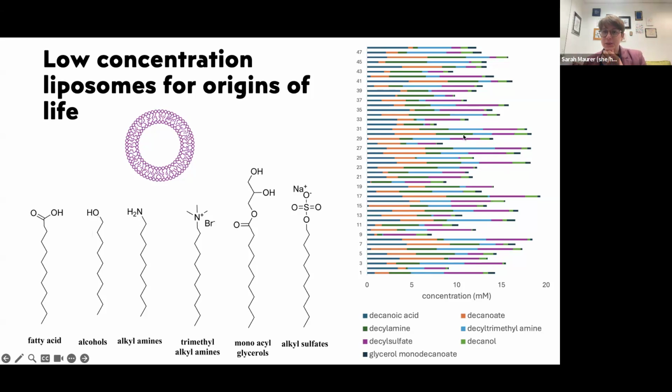Okay, so the next question is, did you consider possible order of assembly? For example, making fatty acid vesicles first and then adding esters. Something about mimicking the evolutionary pathways of increasing complexity. I have not, but other researchers have looked at starting with a single membrane group and slowly adding in micelles that then get absorbed by those liposomes. And you can make vesicles grow that way.